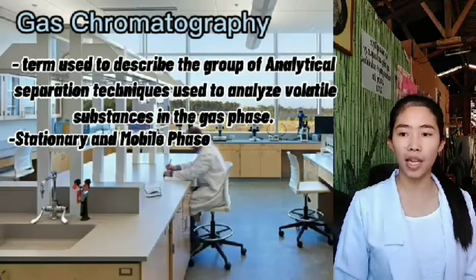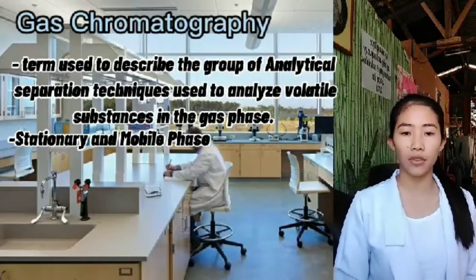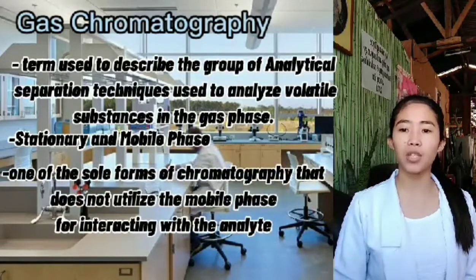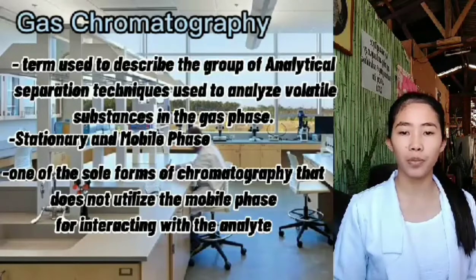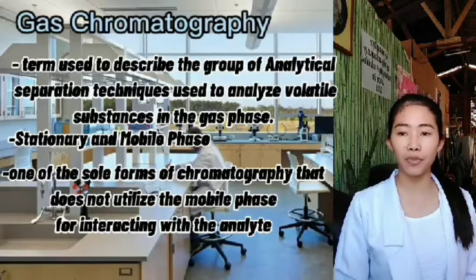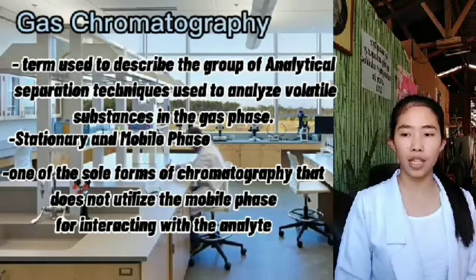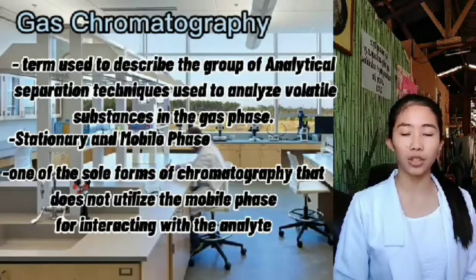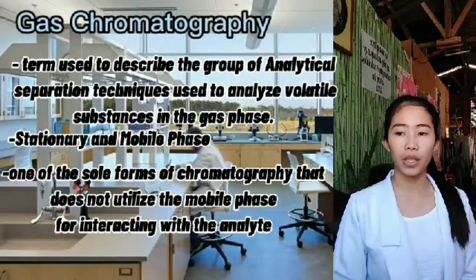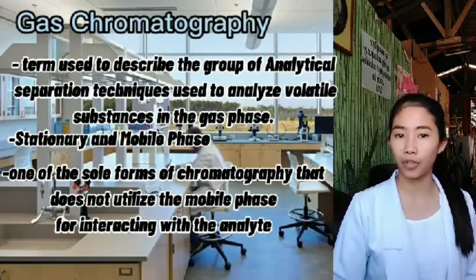The mobile phase is a chemically inert gas that serves to carry the molecules of the analyte through the heated column. Gas chromatography is one of the sole forms of chromatography that does not utilize the mobile phase for interacting with the analyte. The stationary phase is either a solid adsorbent, termed gas-solid chromatography, or a liquid on an inert support, termed gas-liquid chromatography.